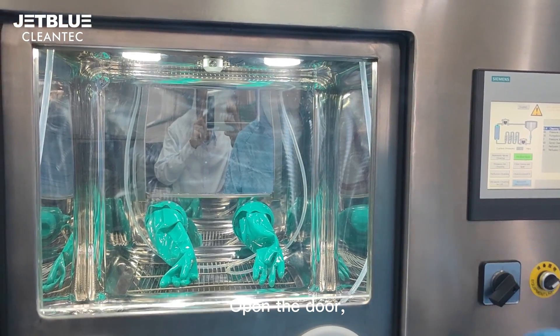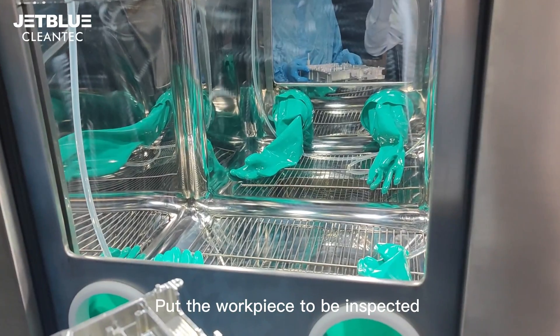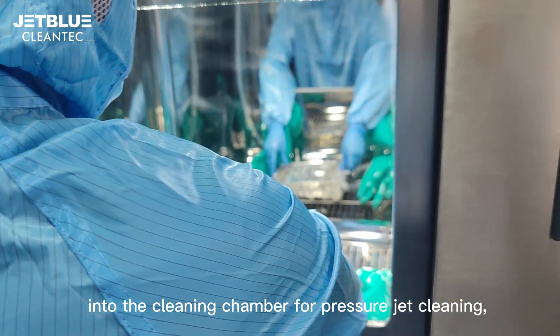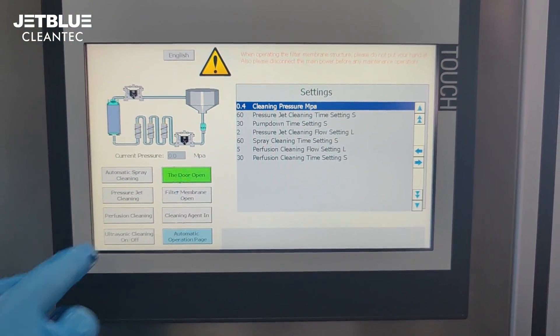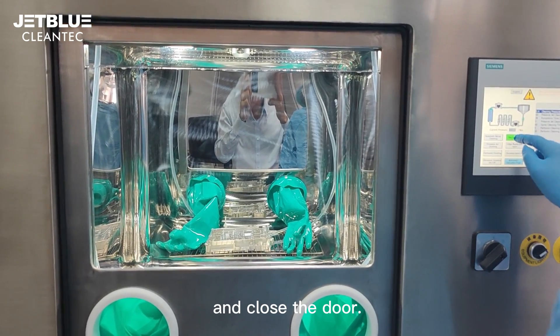Open the door, put the workpiece to be inspected into the cleaning chamber for pressure jet cleaning, and close the door.